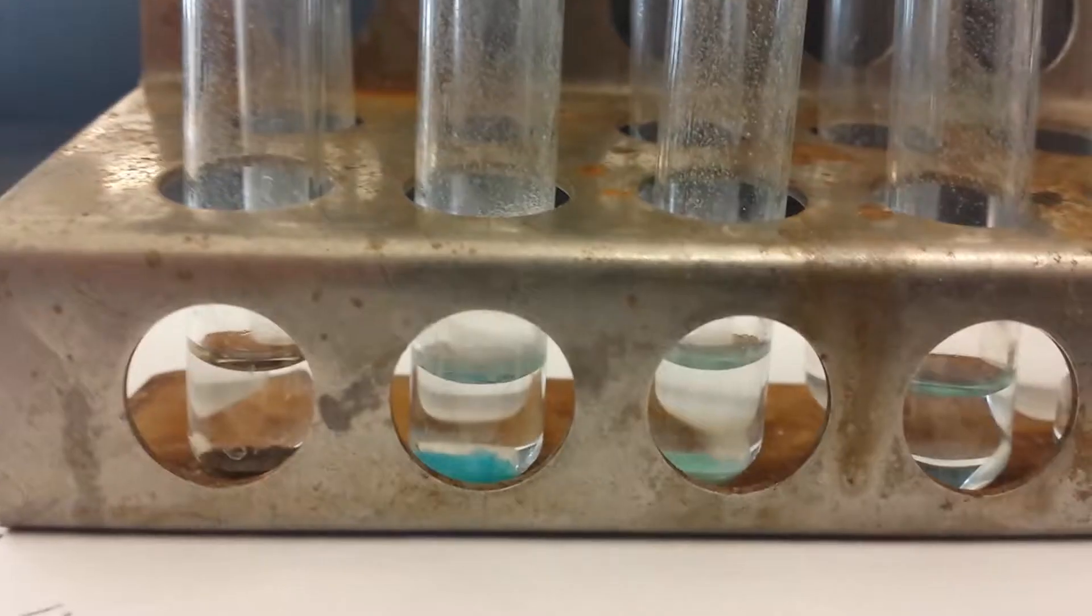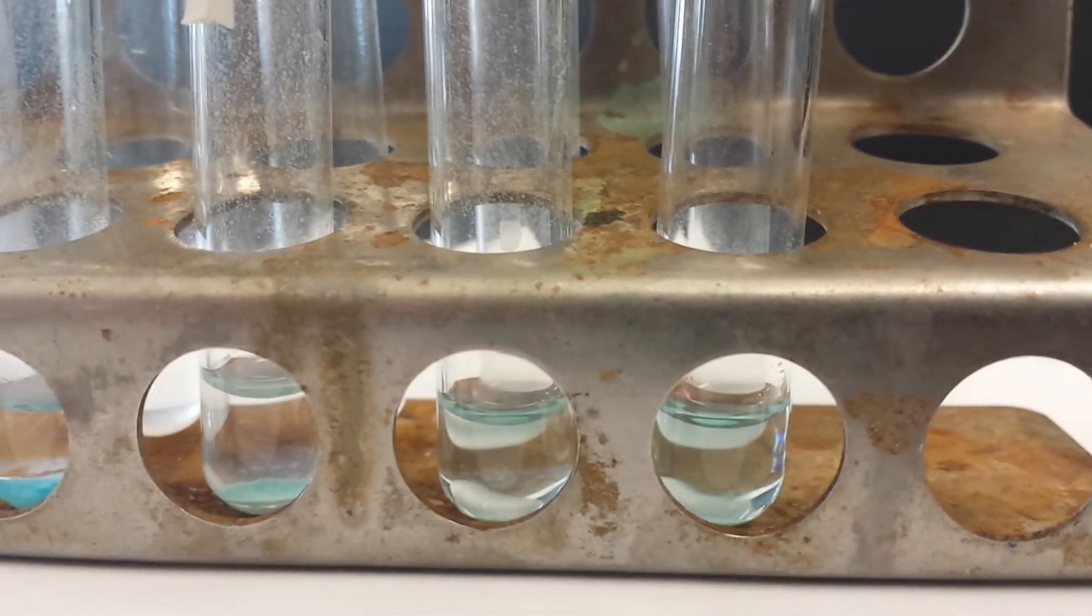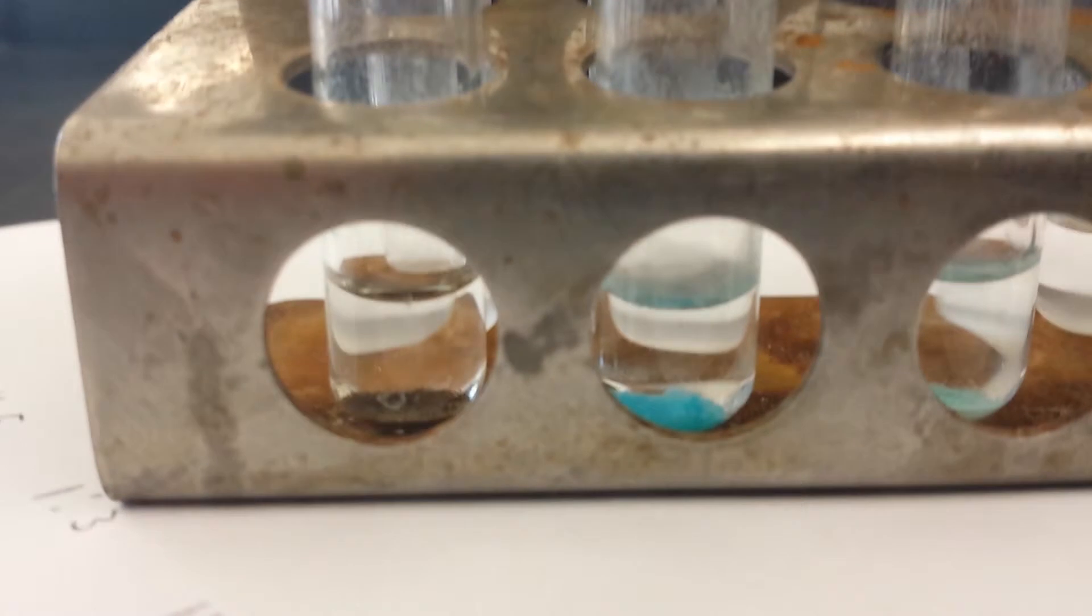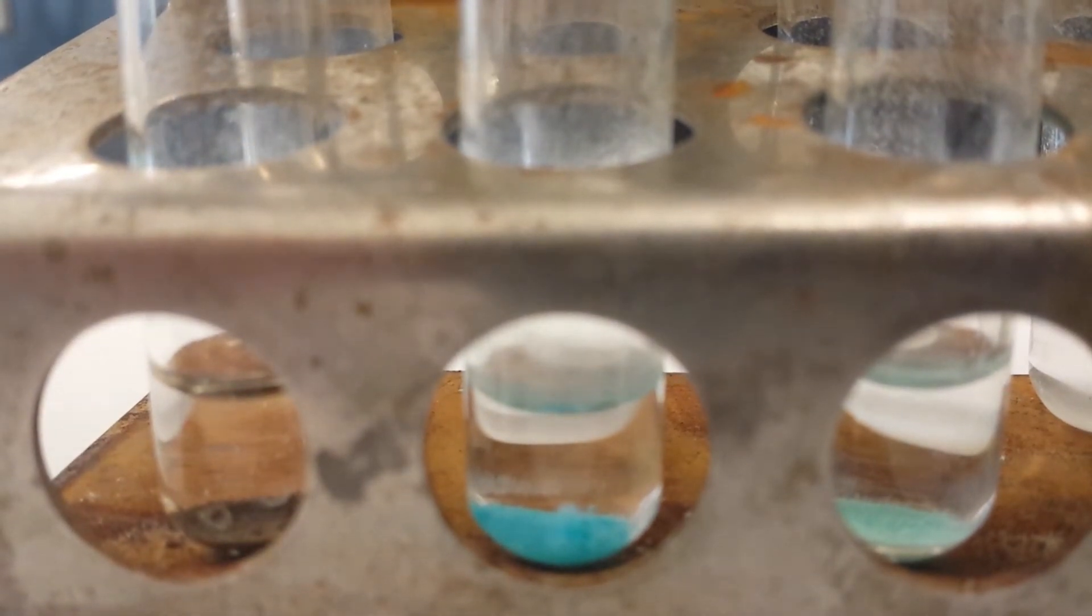If we compare the reactions of copper chloride and sodium hydroxide in order to make copper hydroxide, we see that the biggest precipitate is clearly this one, which is test tube number 7, in which the ratio was 1 to 2.